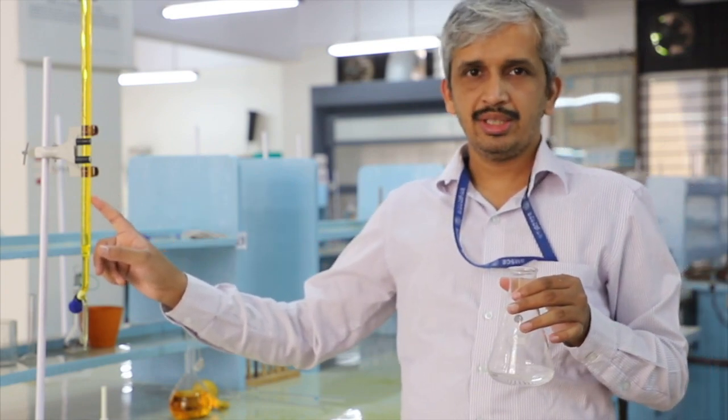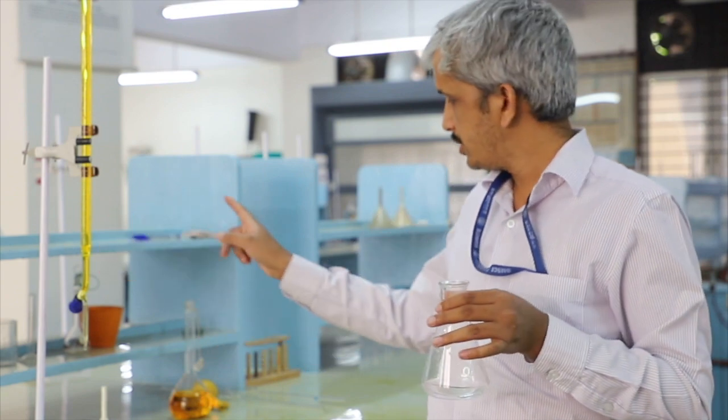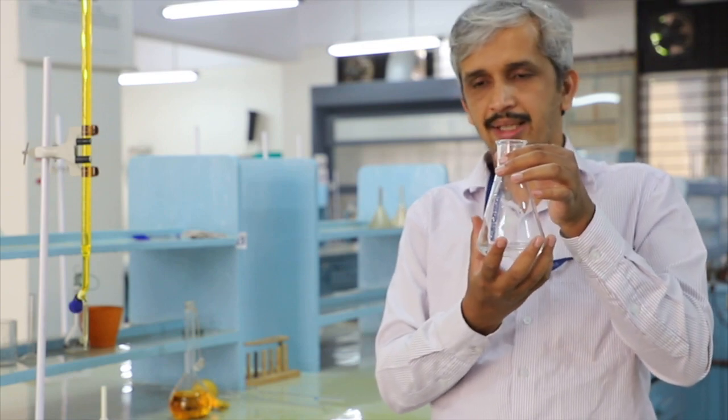Buret: wash with tap water, rinse with distilled water, rinse with the solution to be taken. It's also true for the pipette. But in case of the conical flask, it should be washed with tap water, rinsed with distilled water and stop there. It should not be rinsed with the solution to be taken.